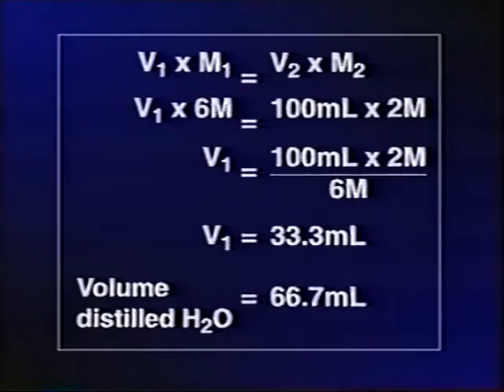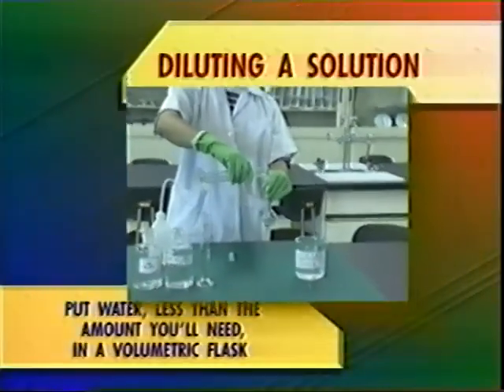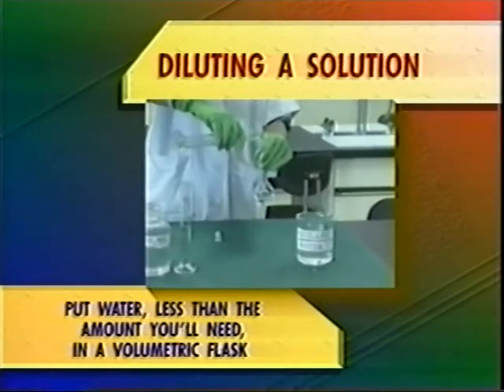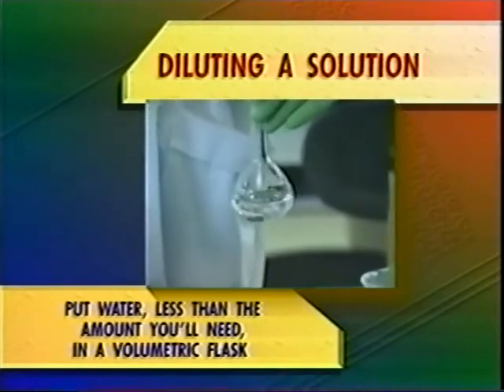The difference between 100 milliliters and 33.3 milliliters, 66.7, is the approximate volume of water required for this dilution. When making this dilution, first put water in an amount less than you'll need in a volumetric flask. In this case, say 50 milliliters.